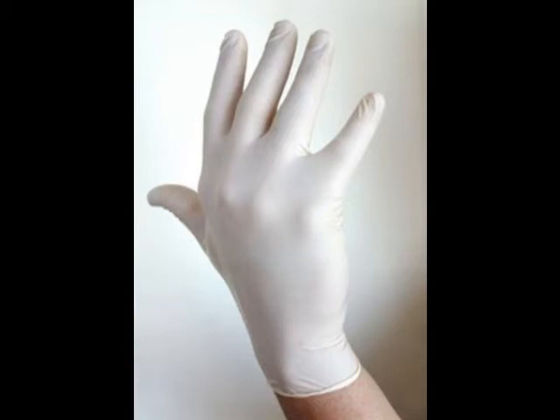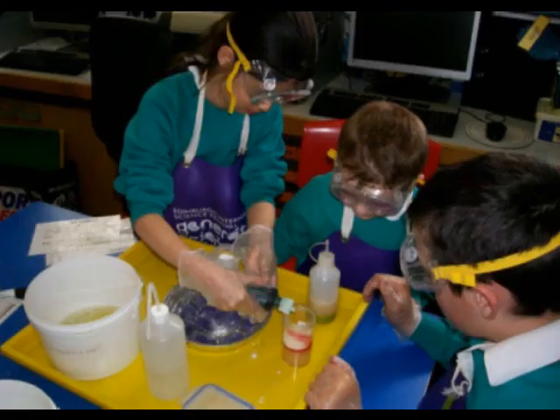The last part of our science safety videos is going to be rubber gloves like the one in this picture. We might be using these rubber gloves in our science labs if ever there is something we don't want to contaminate with our germs, or if ever there is something that we don't want directly on our skin. First, you want to make sure that you don't have any allergies to the type of material the gloves are made out of. Most gloves are made of latex and there are some people allergic to latex.